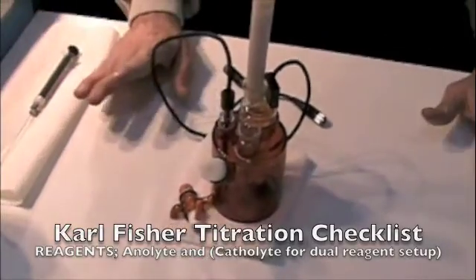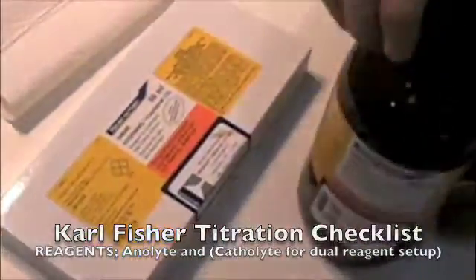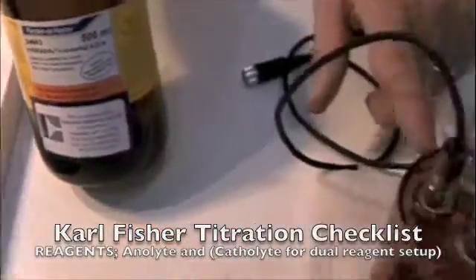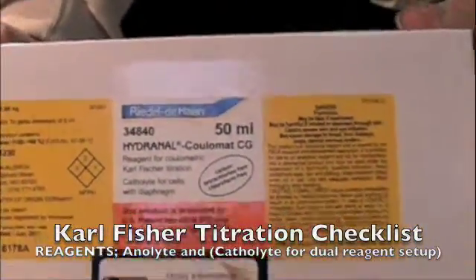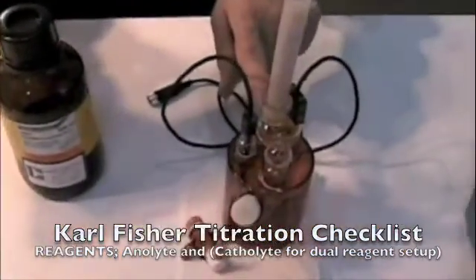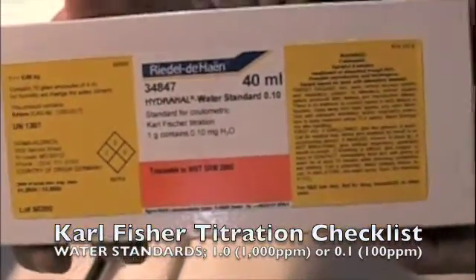The first step in Karl Fischer is knowing what supplies you need to run a Karl Fischer test. First, you're going to need your reagents. You're going to have Hydranal AG Coolomat for the vessel. You're also going to have Coolomat CG, which is the catholyte, and in the case of a dual reagent setup, a dual reagent generator electrode, you're going to require this additional reagent. A water standard for checking your Karl Fischer moisture for accuracy is also recommended.